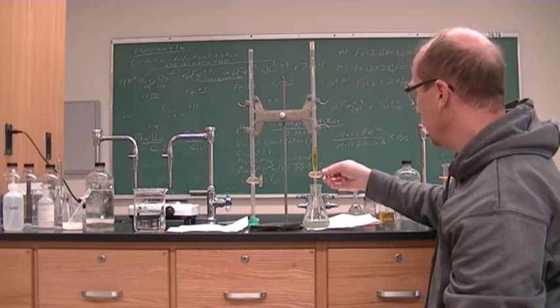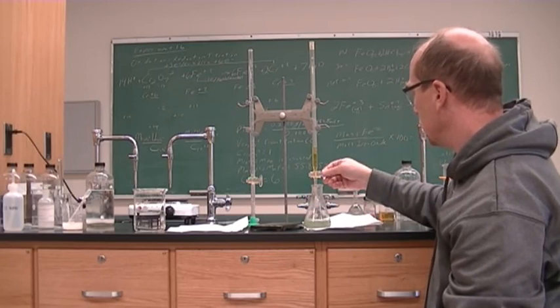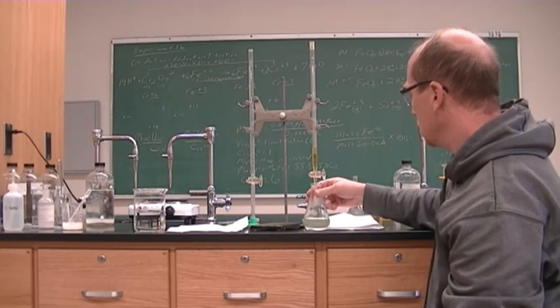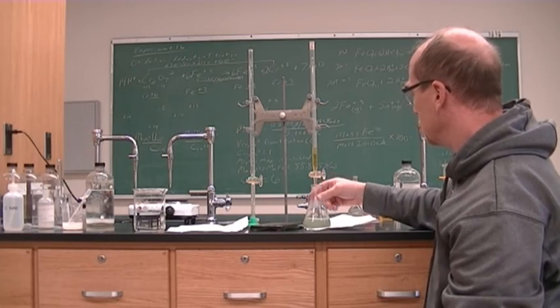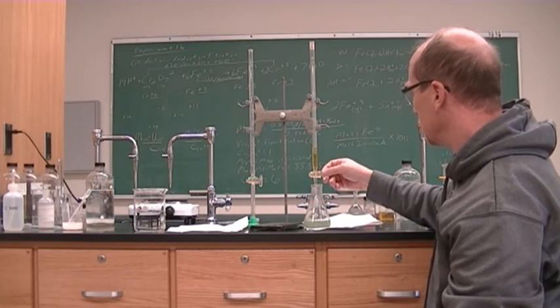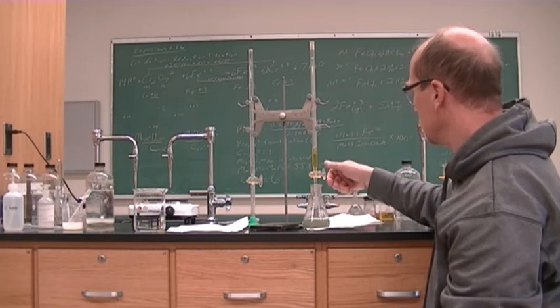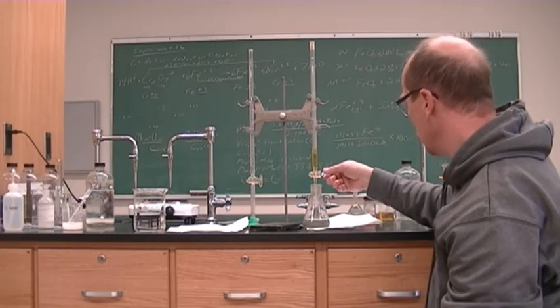It's getting really close to the end. Ooh, that was close.